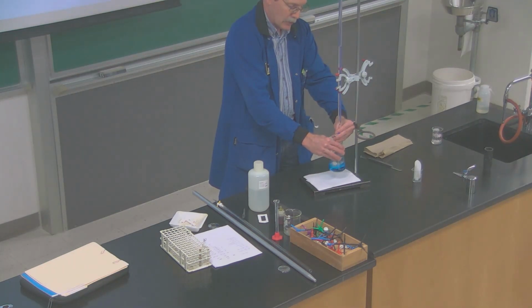This one goes through a little bit of a green stage where you've got both forms, the basic form that's blue and the acidic form that's yellow. And at that point, you'll have a little bit of a green color. So it's not quite as sharp as the phenolphthalein, but you can get there, and you'll notice it's getting a little bit paler as I'm getting close to the end point too. So that helps when you're getting close. And you can see it's almost persistent there with the color change. And so you can get it there.